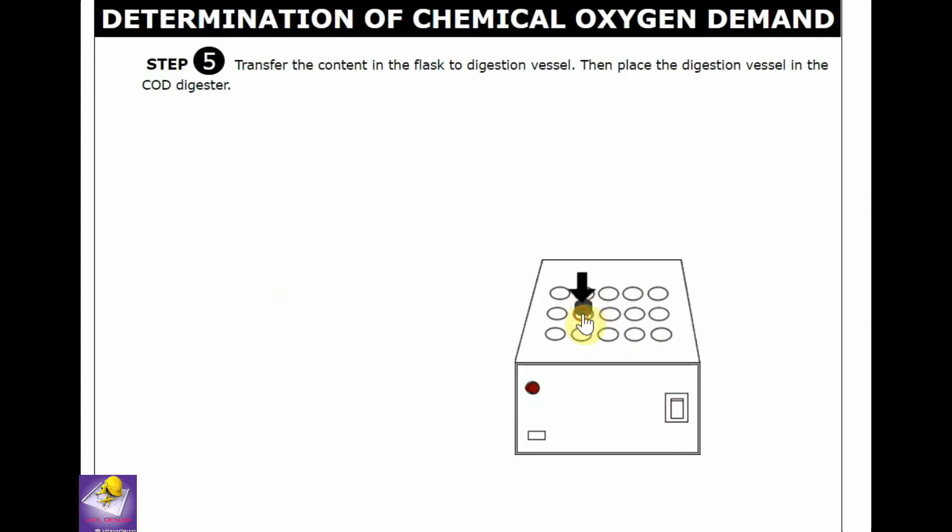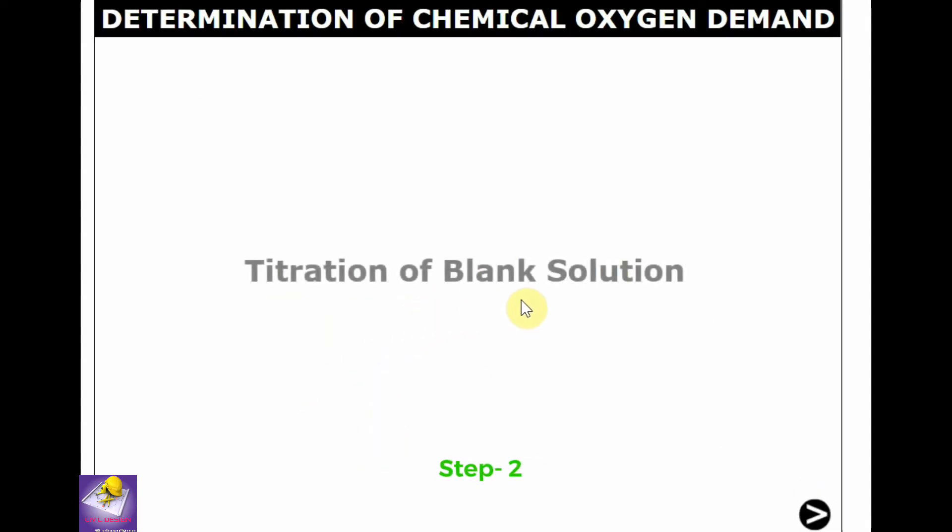Stick out the digestion vessel. Allow the content to cool for 30 minutes in a cup area. Now titration of blank solution.